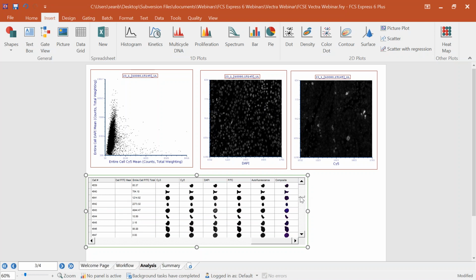And if you remember when I talked about those preferences about which image mask to be loading up, you can see here that these look like nuclei because that's the nuclear compartment that we've decided to load up into the software. And again, that can be changed to the membrane or to the cytoplasm at any time.